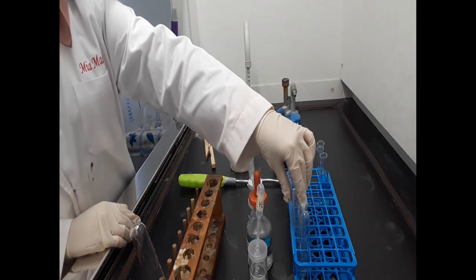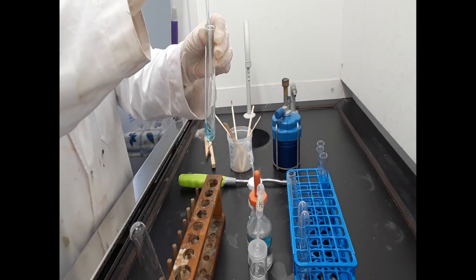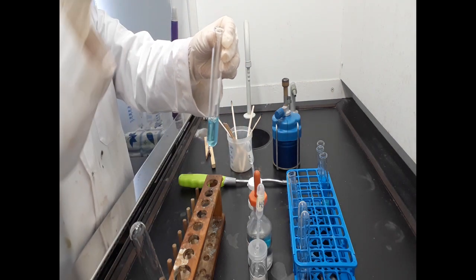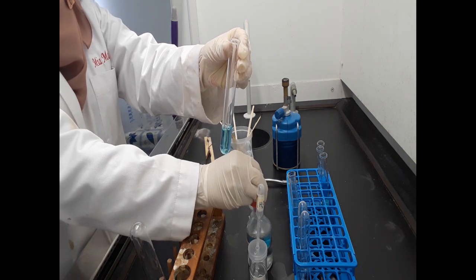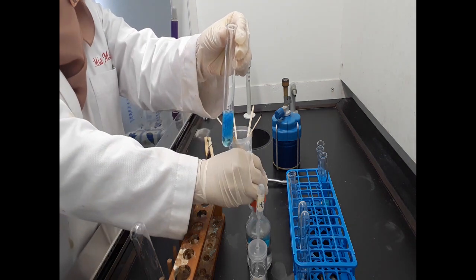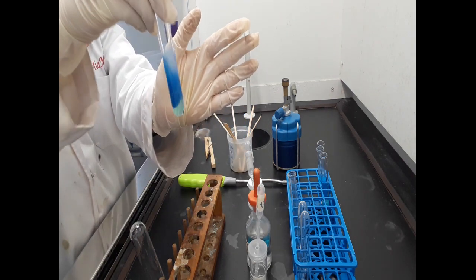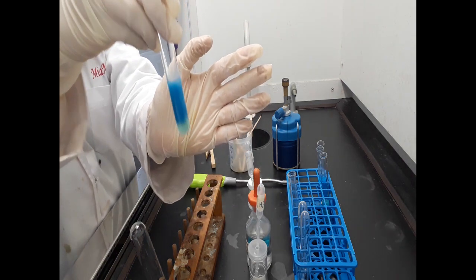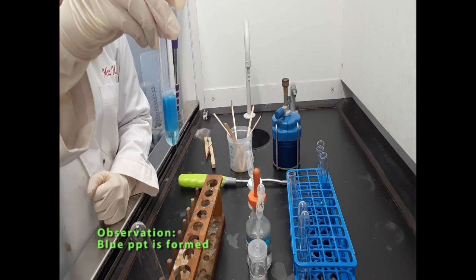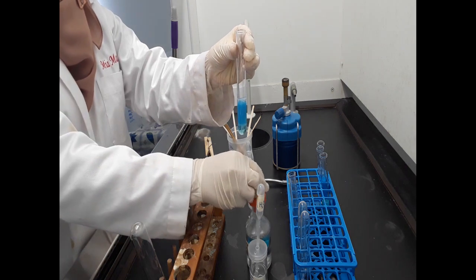Now for solution S, same thing, 2 centimeter cube of solution S. Add aqueous ammonia until a change is seen. Blue precipitate is seen. And then add excess aqueous ammonia.